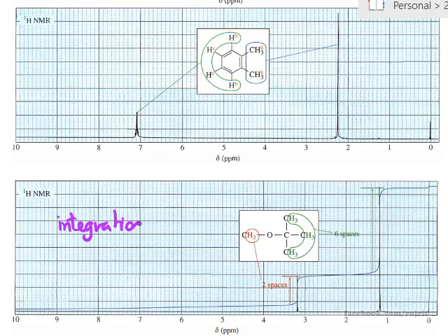The integration here is the integration of the peak area. So at the very far left, there's nothing, right? And when you come to the peak, the area is increasing. So it symbolizes the peak area by this integration line in blue color.